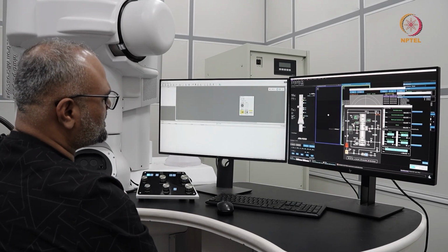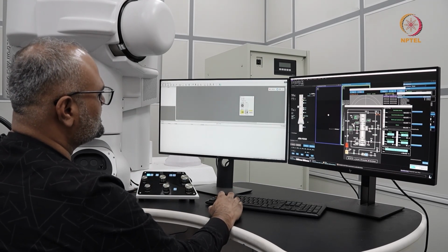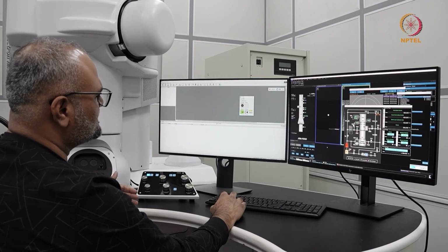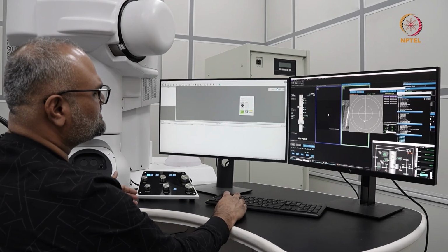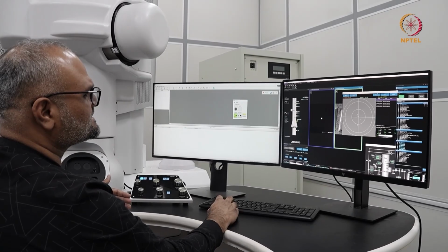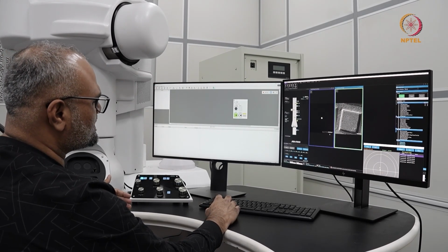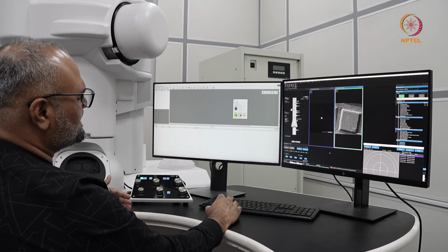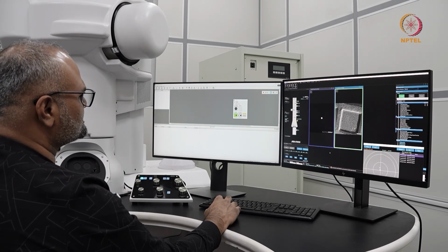Depending on your microscope configuration, you might want to tilt your specimen or orient your specimen into a particular angle, because to improve the collection efficiency of an EDS detector, it is advisable that your geometric parameters are considered, and most commonly you have to tilt the specimen along the alpha or the x direction to approximately 10 to 15 degrees to ensure you have a very good count. But in the modern microscopes where you have sort of segmented EDS detectors or the annular EDS detectors, you really need not tilt the sample.